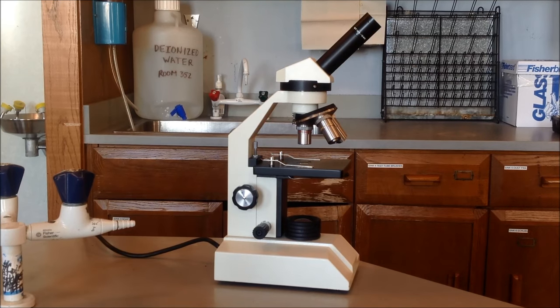So now we're going to go really quickly just take a quick tour of the different parts of the microscope. This is in reference to part one in the packet for the activity here.